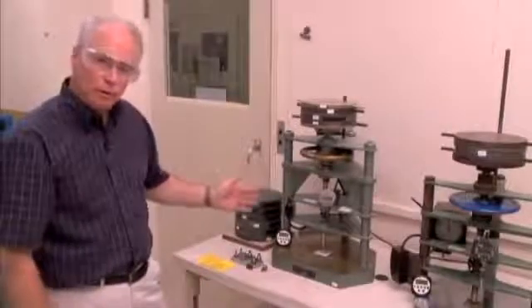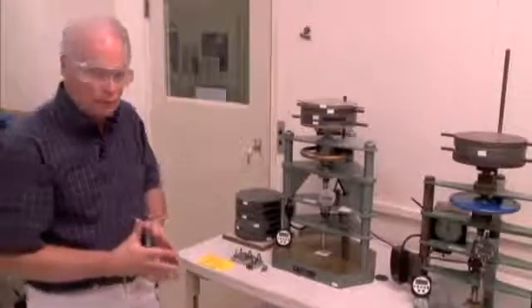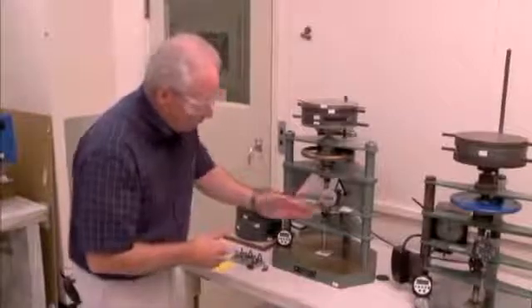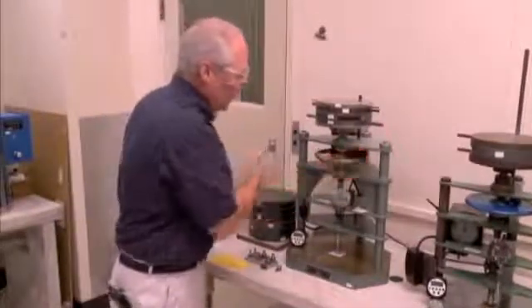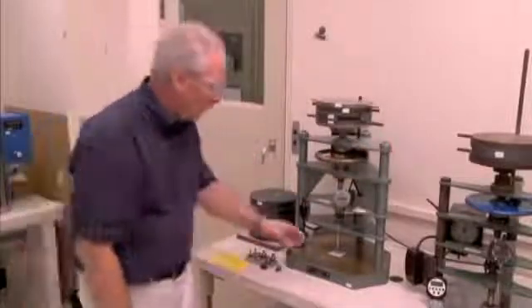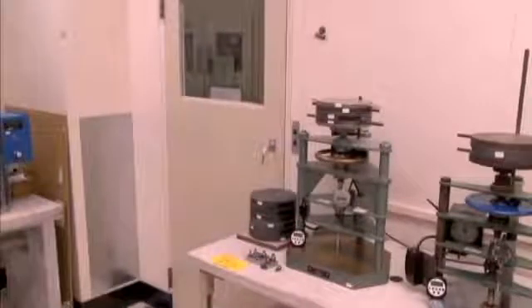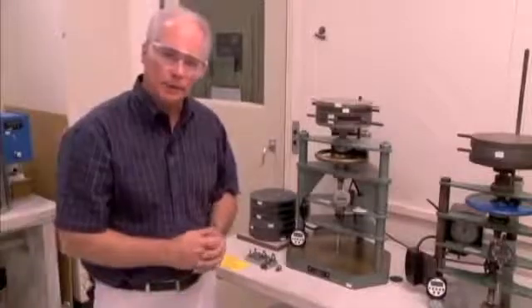When the timer goes off, whether it's 1 minute, 5 minutes, 15 minutes, or even 24 hours in the case of longer term static loads, they will take the initial indentation after the time period and then take the load off of the sample. And in the case of residual indentation, the sample will be allowed to recover for 60 minutes, and then they'll remeasure the thickness of the product and calculate the residual indentation.